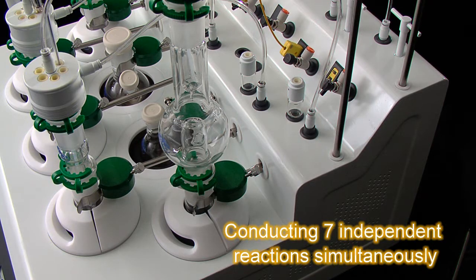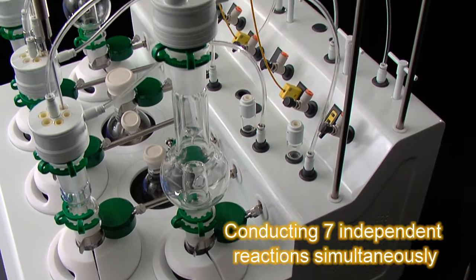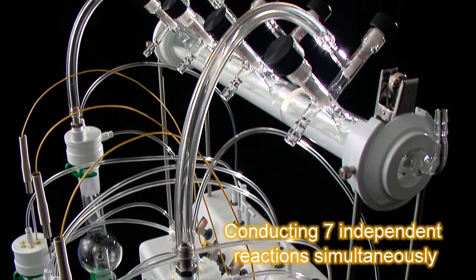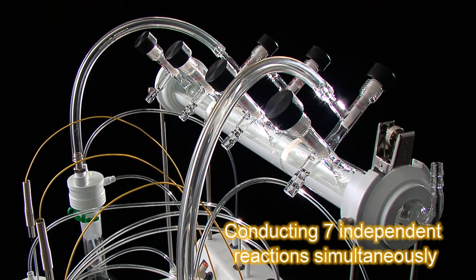Pro7 has up to seven reaction channels to conduct up to seven reactions simultaneously. Each channel can be controlled independently.